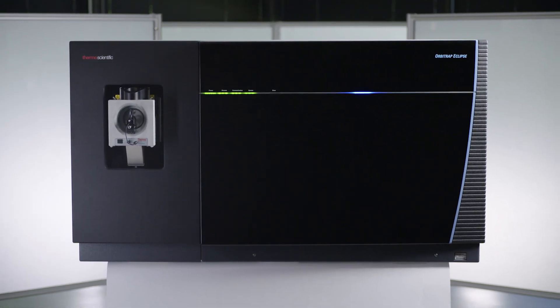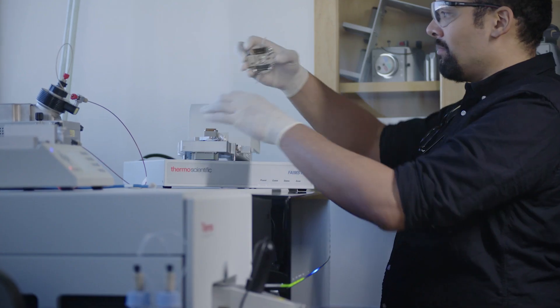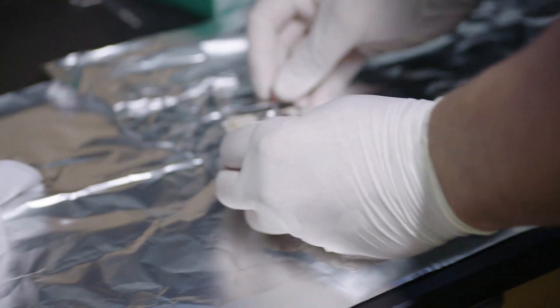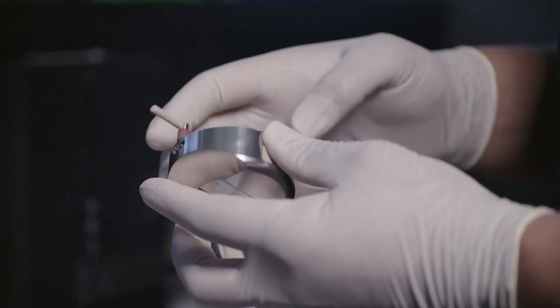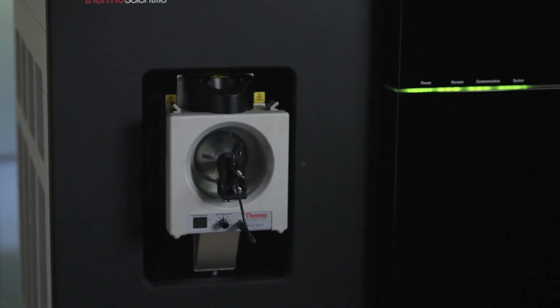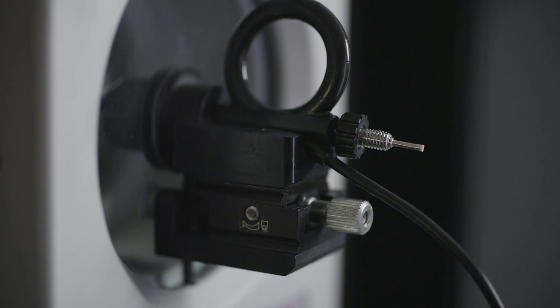The Thermo Scientific Orbitrap Eclipse tribrid mass spectrometer provides several new opportunities to really increase and improve this methodology. When we put them all together and look at the overall picture of how they work within the new instrument, we've noticed better than about a 50% decrease in the time that we take for doing our analyses. So instead of 36 hours to do a typical analysis for 11 different conditions, we can accomplish that now in half that time — in 18 hours.